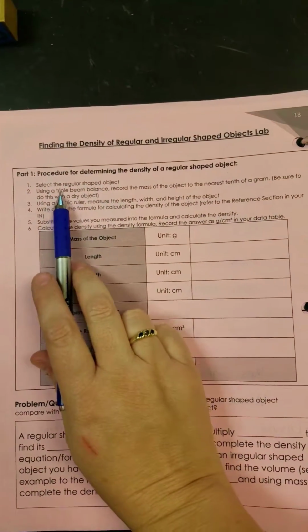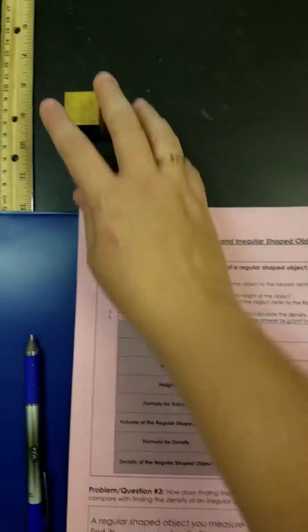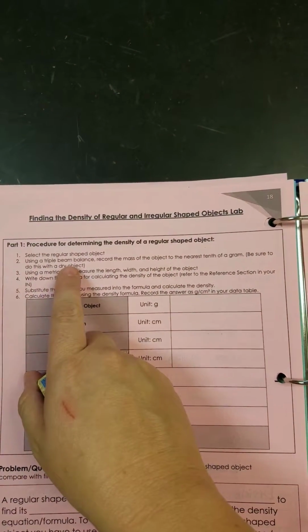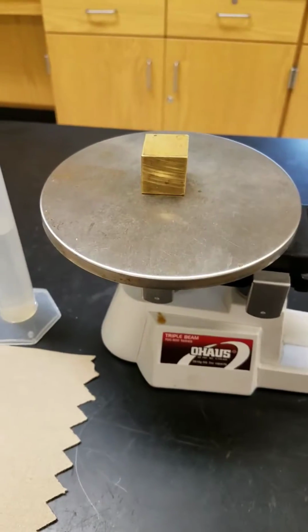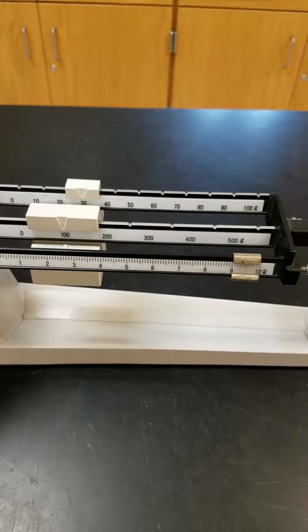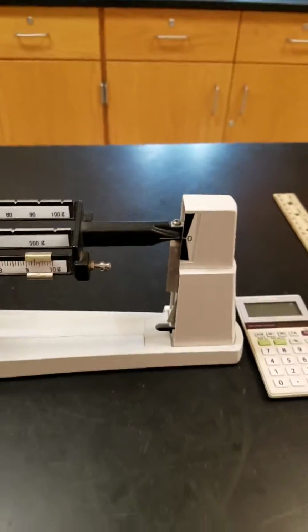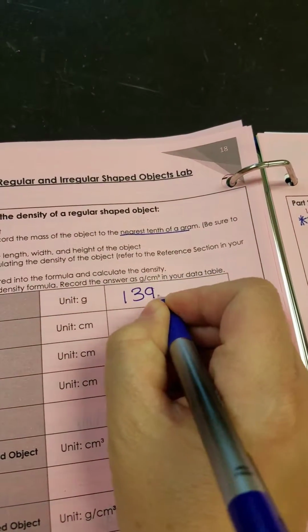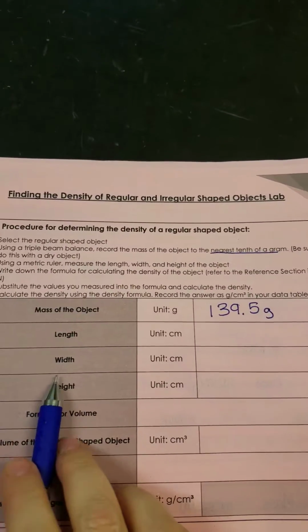So here's the part 1. These are the procedures that we're going to follow. First, we're going to get our regular object. That's going to be this cube. Then it says, using a triple beam balance, record the mass to the nearest tenth of a gram. Alright, so there's our cube. And here are our answers. We have 139.5. And you can see it's balanced out. So our mass is 139.5 grams.